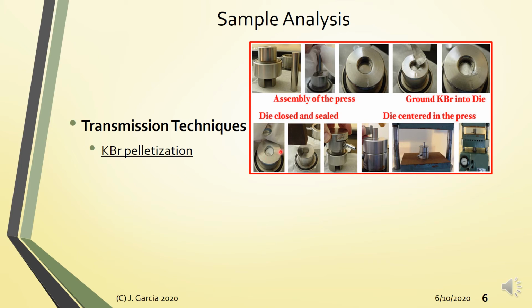So basically here, after forming the crystal, meron kang apparatus doon sa loob ng sampling chamber mo. Let's have the pen. Alright. Sa sampling chamber mo, so kung ito yung light source uli, saka yung detector mo, yung crystal ay nilalagay sa gitna, para dito dadaan yung infrared. Kaya siya talaga transmission technique. So KBR is used, or even anhydrous sodium chloride can also be used.